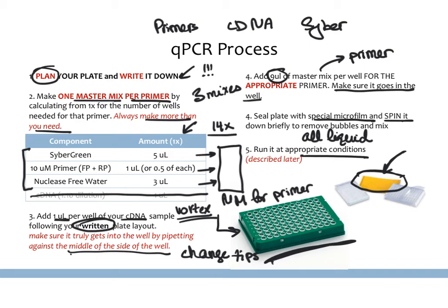The one point I want to make is that here I have provided you with a 10 microliter PCR recipe. The standard is to do 20 microliters, in which case you would simply double every component that I've listed here. But 10 microliters can be used if you're trying to save SYBR Green because it can be quite expensive.